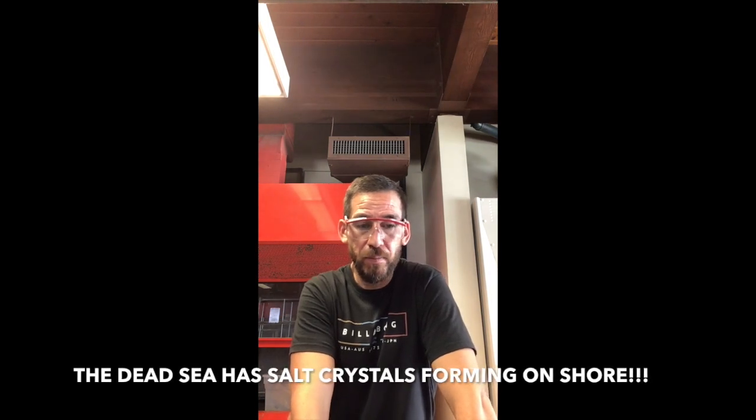be very different, because sugar is this cyclic, basically carbon, oxygen, and hydrogen containing compound, while salt is just sodium and chloride. And it's just the two things kind of just chilling next to each other, and then they form this really awesome structure in the solid form. And so I think it would be really cool for us to kind of observe that.